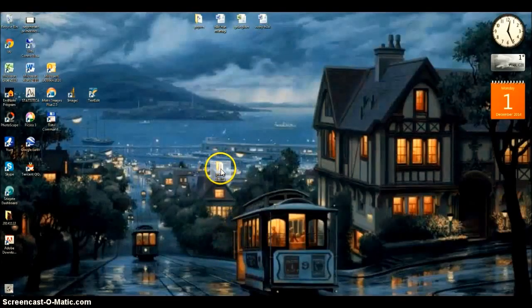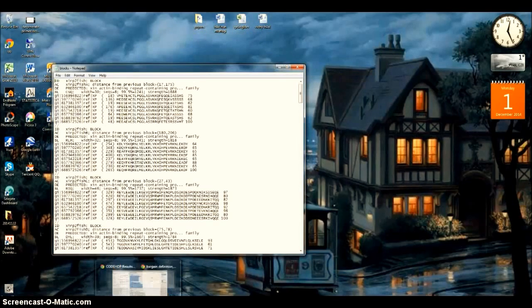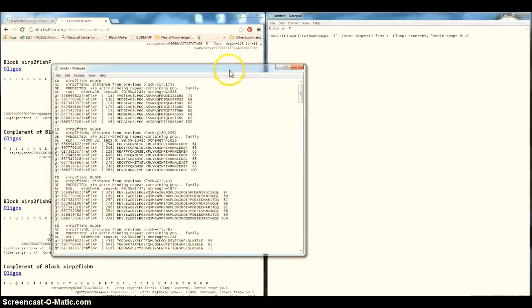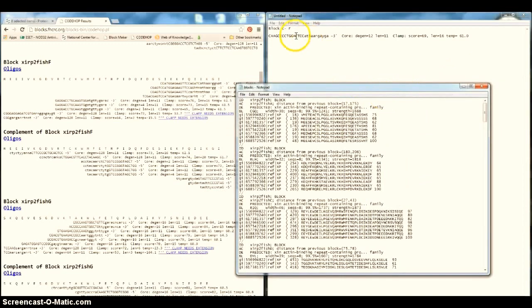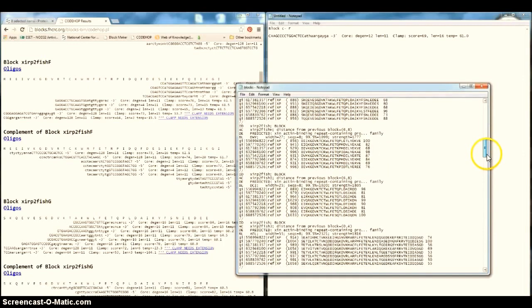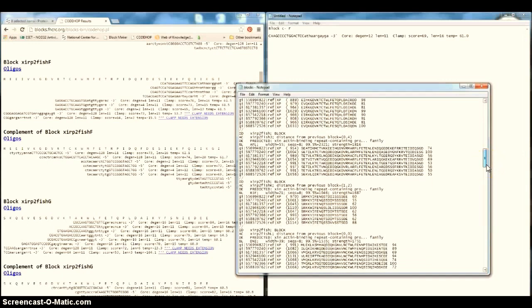First we need to see this. Okay, I want to show you how to choose the reverse because it's important to define your target length of the sequence. It will be important later because you will choose your markers according to this information, and so on.